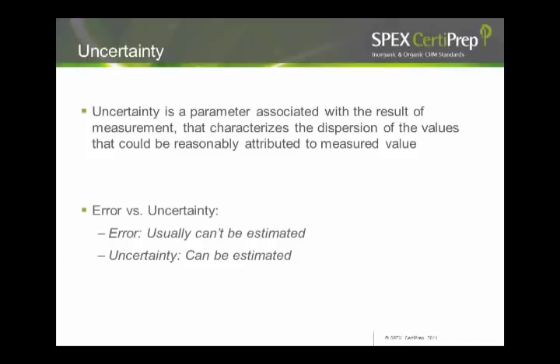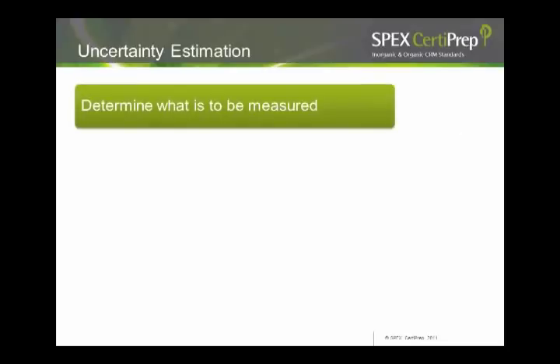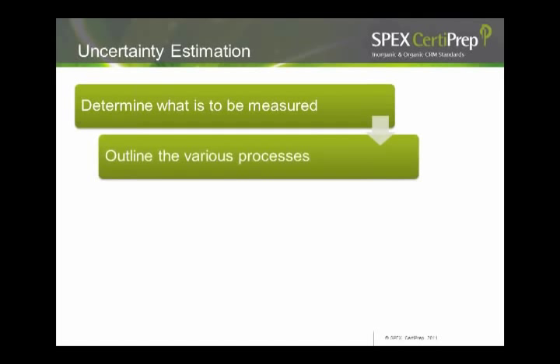So earlier I said you take an average of measurements. Taking the average of measurements is one way to get an estimate of the true value. What is accuracy? Accuracy represents the closeness of the measured value to the true value. In this graph, the red line is the intended true value. The green graph indicates the values obtained by the measurement. As you can see, the measurements are close to the true value and hence accurate.